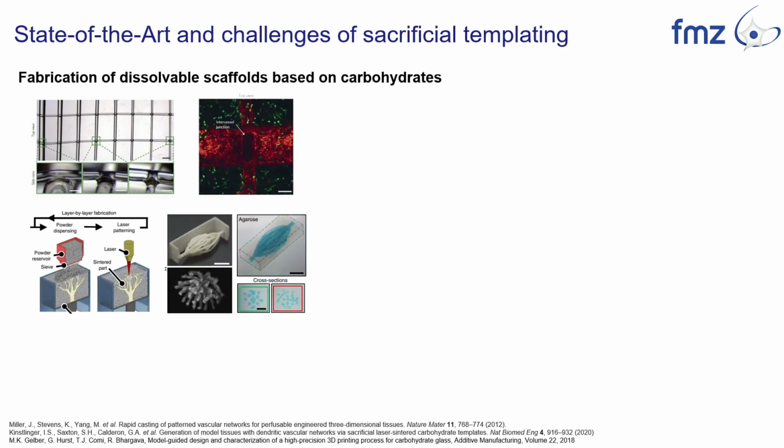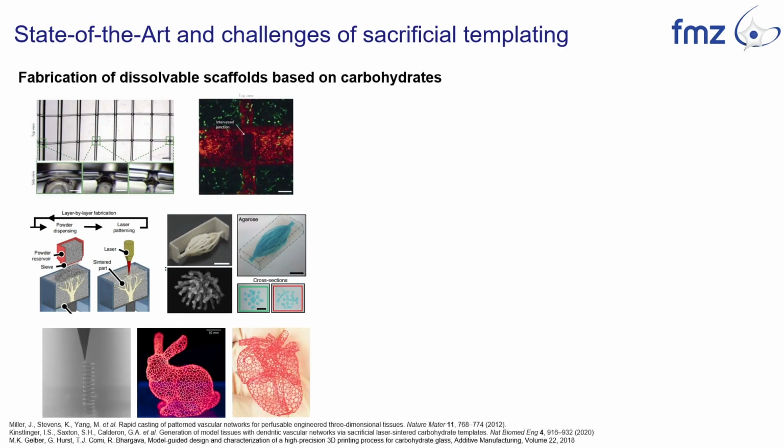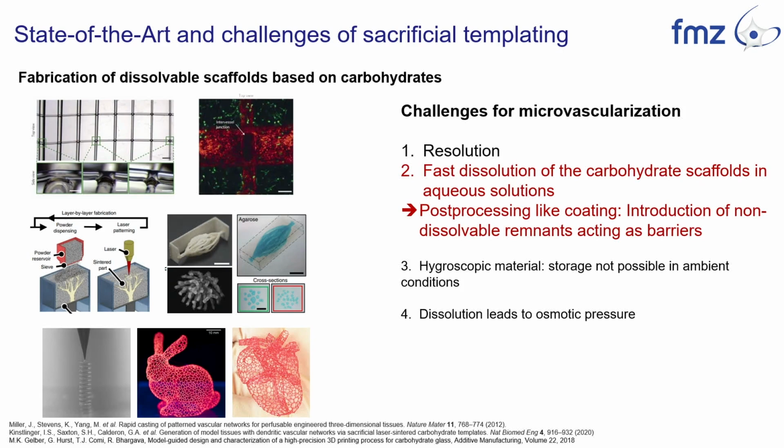It was also shown that you can use this sugar approach with laser sintering to create more three-dimensional structures, or even use freeform printing of sugars to create three-dimensional structures. However, in regards to microvascularization, there are still many problems or many challenges. First of all, it's again the resolution of 3D printing, which in most cases is not good enough for microvascularization.